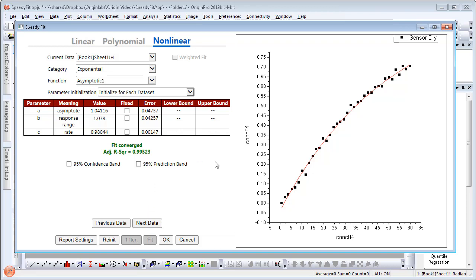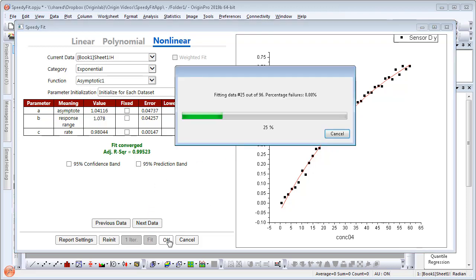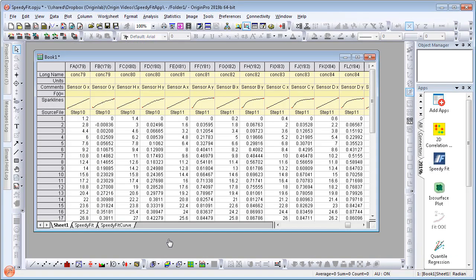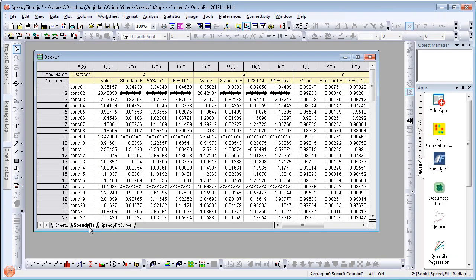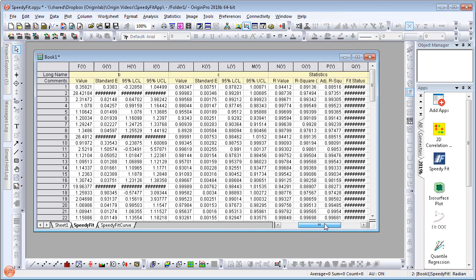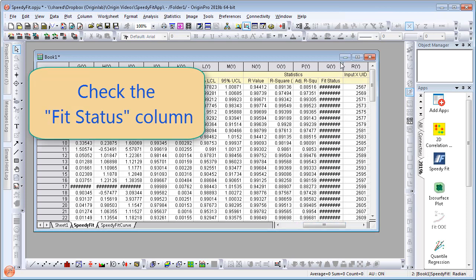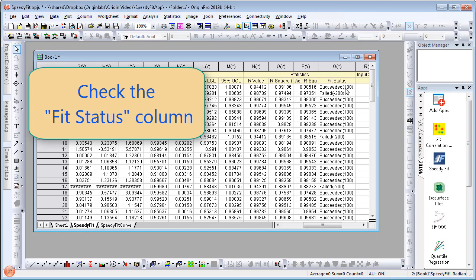Once you are satisfied with all of the settings, simply click OK and the fit will be performed very quickly for all of the data sets. You will get a summary sheet in the workbook with the name of the data set, the parameter values, and confidence levels. Also, there is a fit status column where you can check to see which data sets failed.